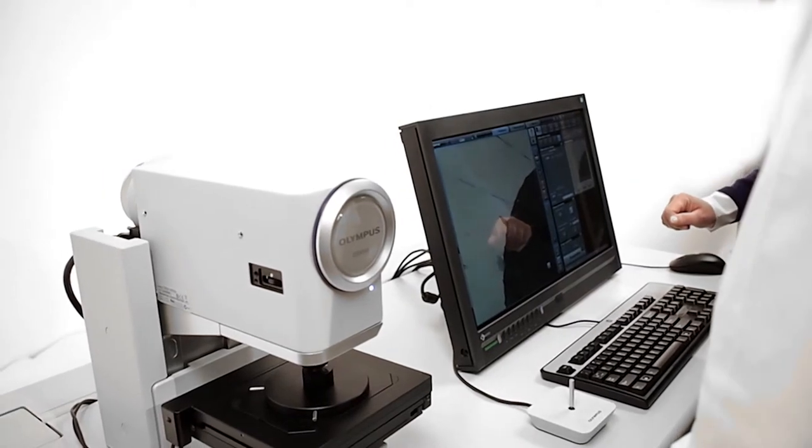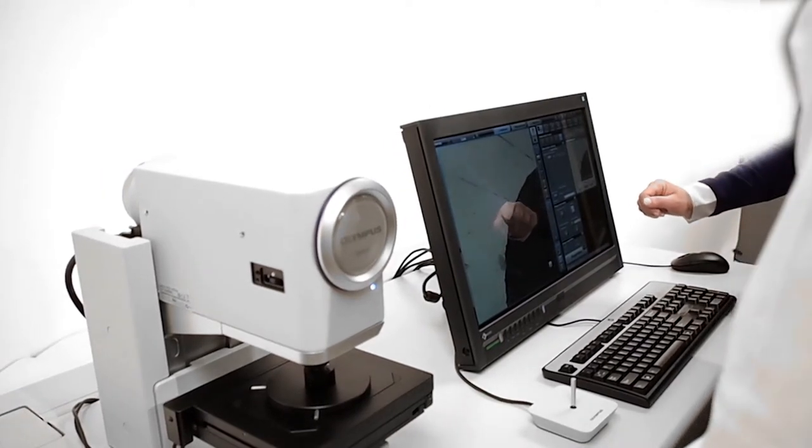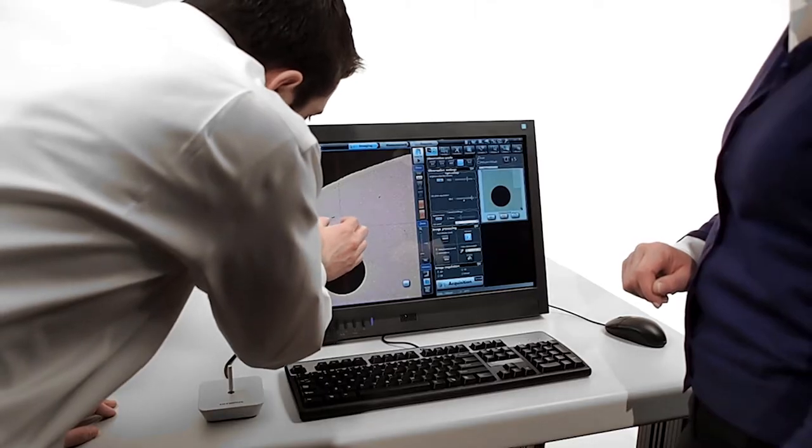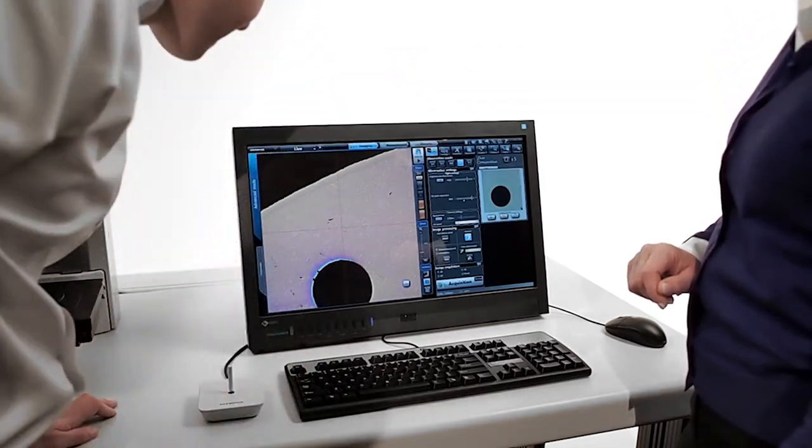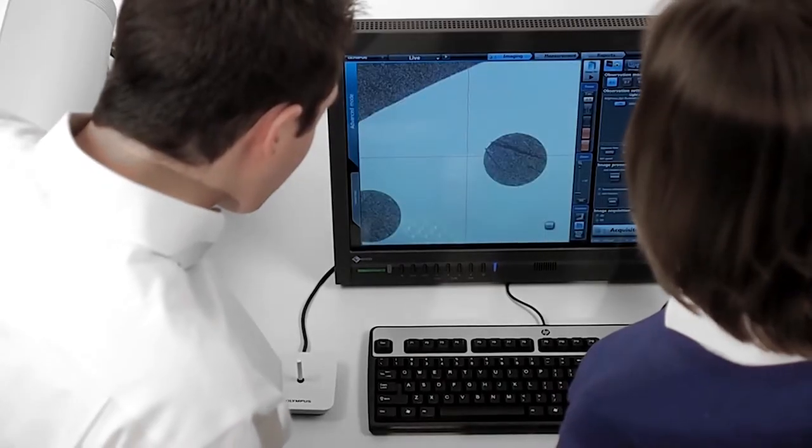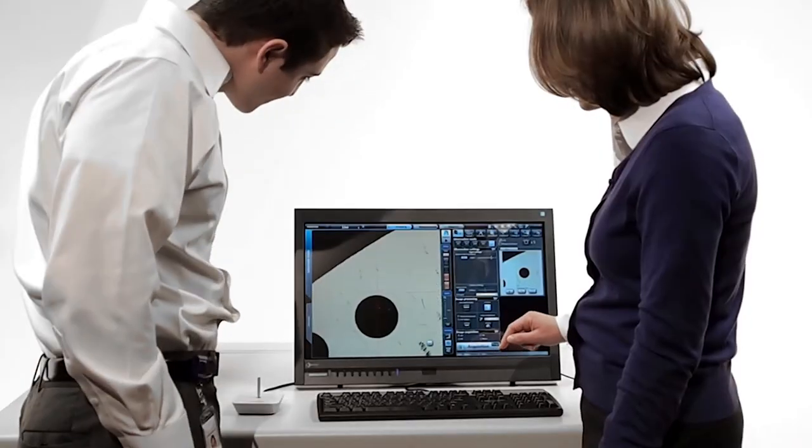Because DSX series instruments are so easy to use, multiple users from the occasional user to the in-house expert can achieve the same consistent, reliable results every time.